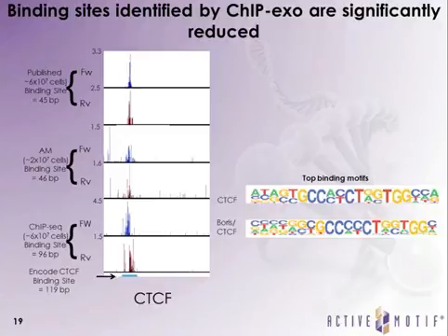So here's the first piece of data that we have. This data was generated to CTCF, and these are the bigwig files you get from using the MACE program. I previously showed you a nice idealized version that I had generated by hand. This is what they actually look like. The top panel is published ChIP-Exo data for CTCF at a certain site, and using 60 million cells, they were able to identify this binding site to have 45 base pairs.